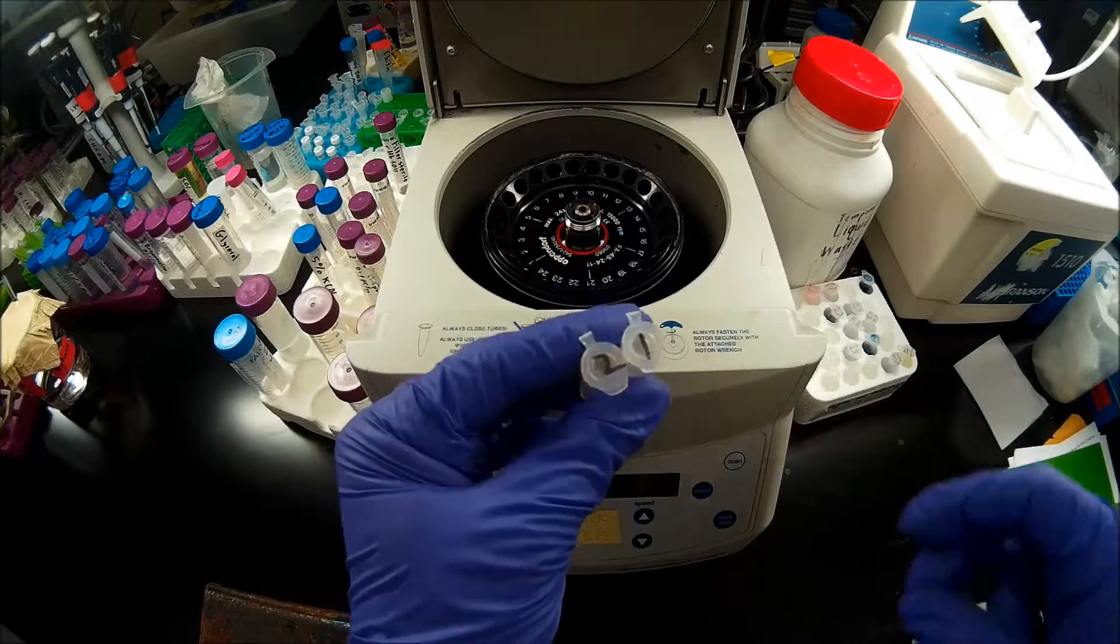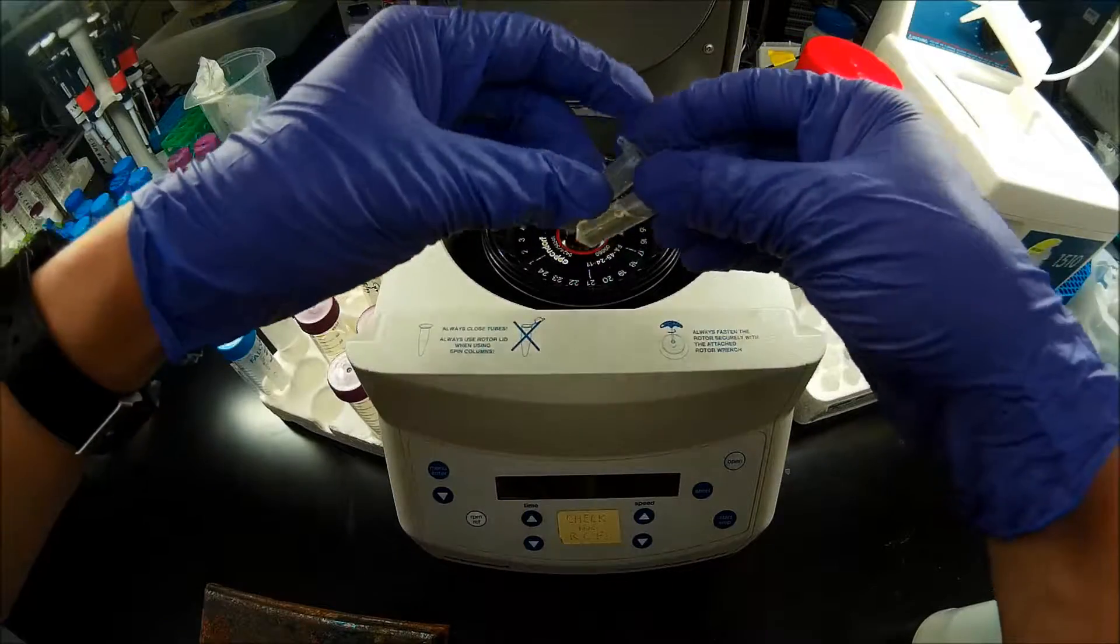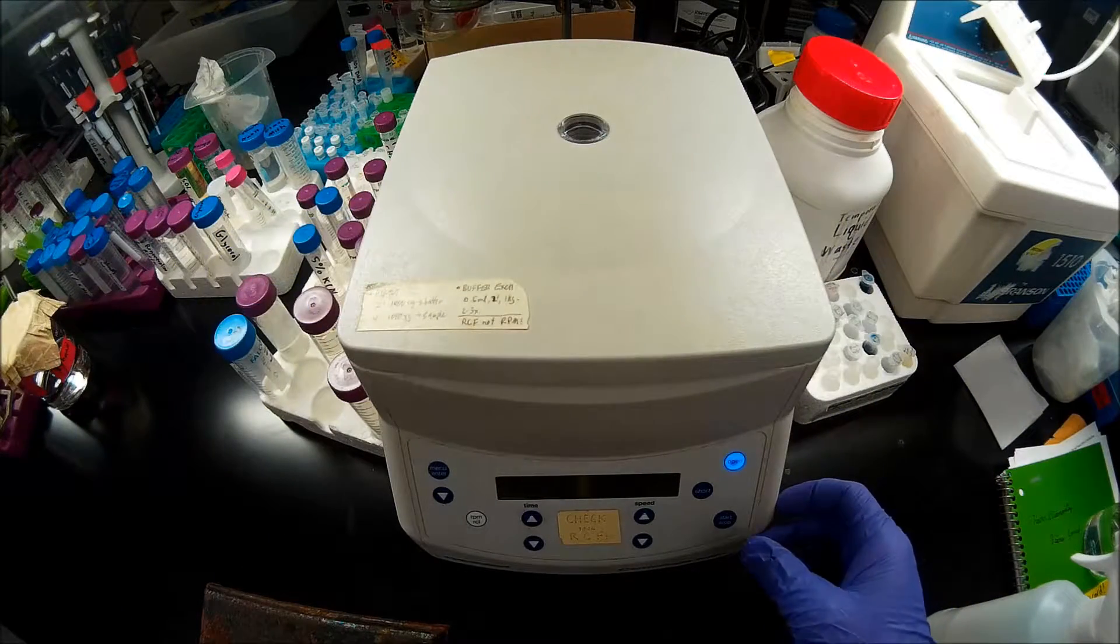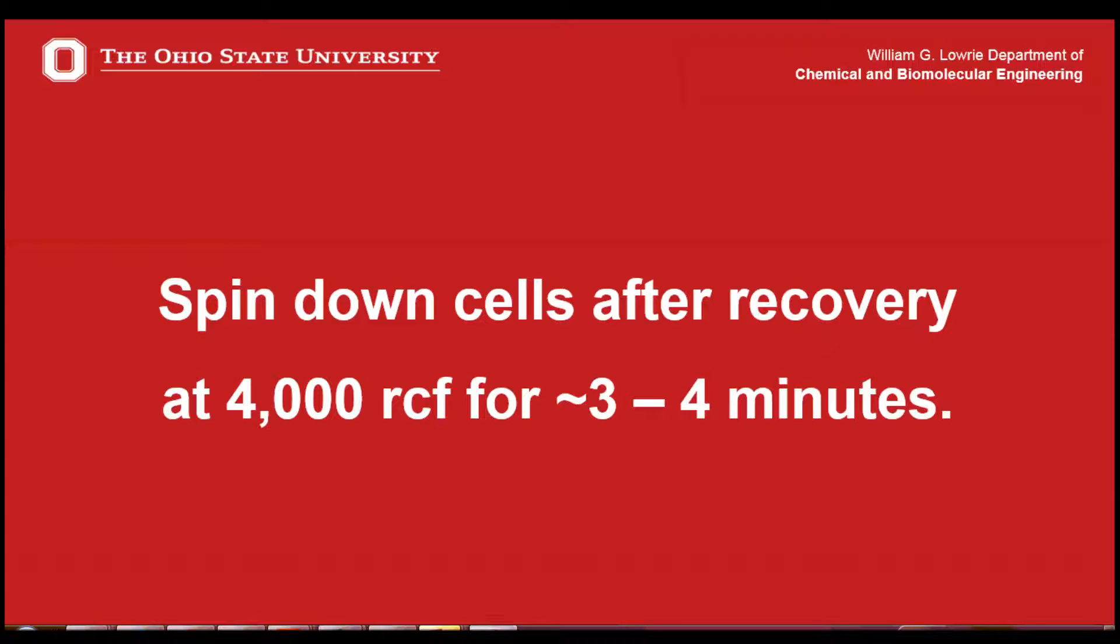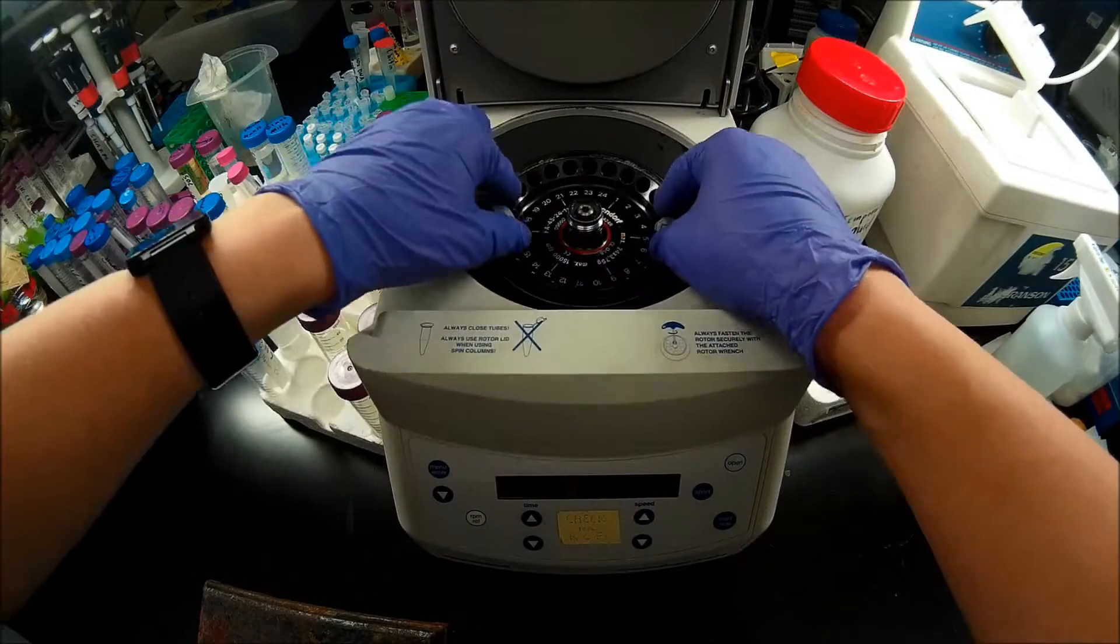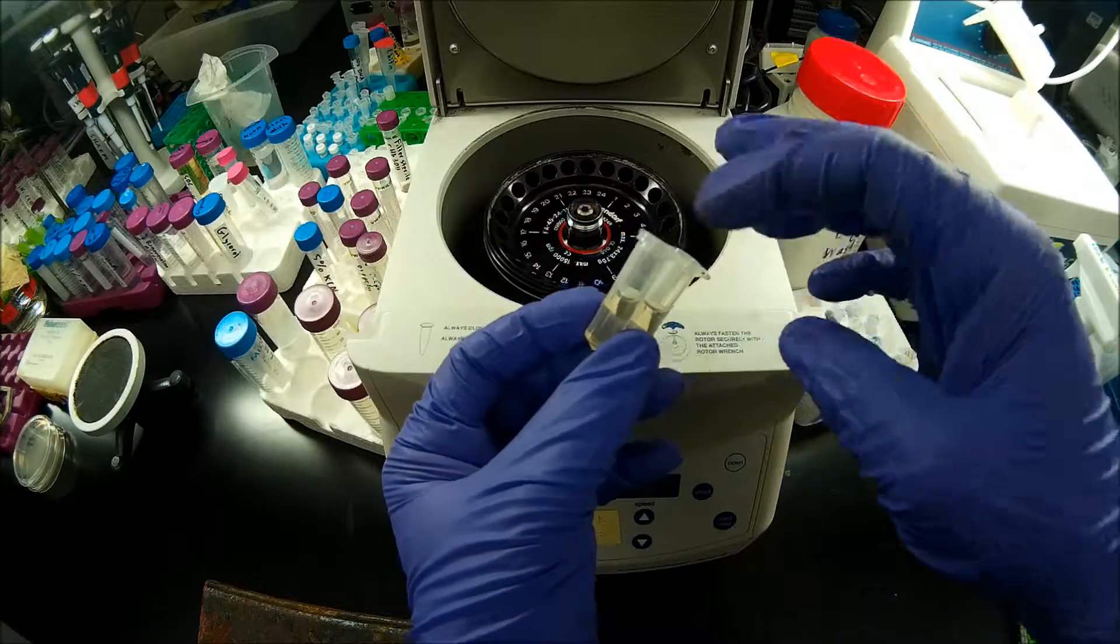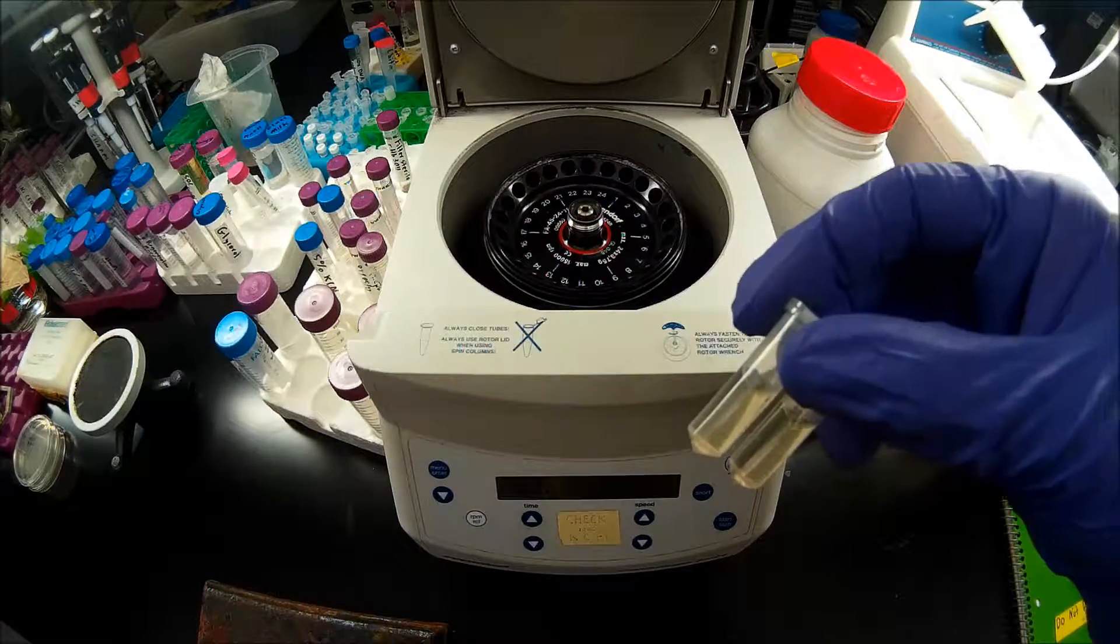After allowing my cells to recover on the rocker plate in the 37 degree incubator for 20 minutes, I want to now harvest the cells that are in suspension. So to do that, I'm going to put these in the centrifuge and spin them down for 3 minutes at no more than 4000 RCF. Once my cells are done spinning, I want to remove them from the centrifuge and discard the supernatant. My pellet is going to be pretty small. The purpose of the recovery step is to allow your cells to recover, not to allow them to multiply. This SOC doesn't have any selection antibiotic in it. So if I leave them in the incubator for too long, my non-plasmid bearing cells will start to outnumber my plasmid bearing cells.